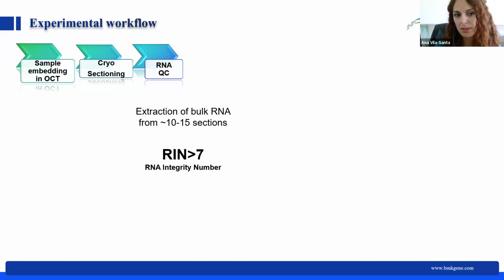7. This is extremely important because if the RIN number is low, this tells us that the RNA is fragmented, and in that case, it's not very advisable to continue to the next steps because likely the formal experiment will not go so well, because fragmented RNA is not easily captured. So when this happens, we actually advise to obtain a new sample that has an RNA with a high integrity.